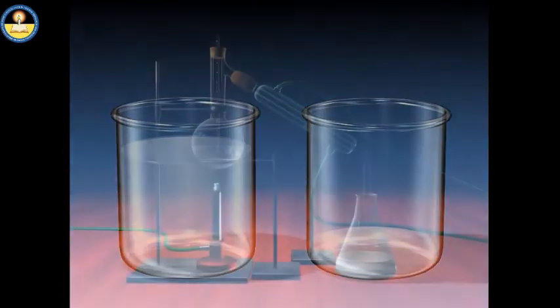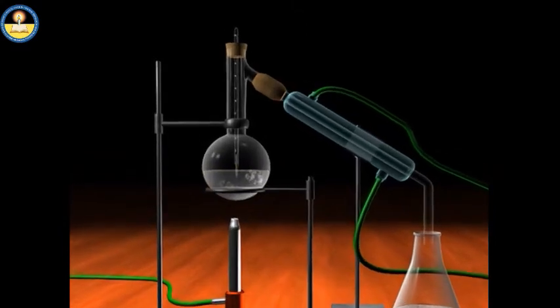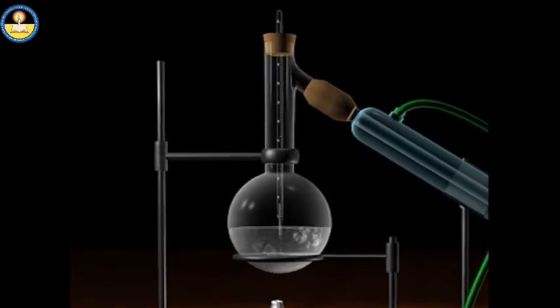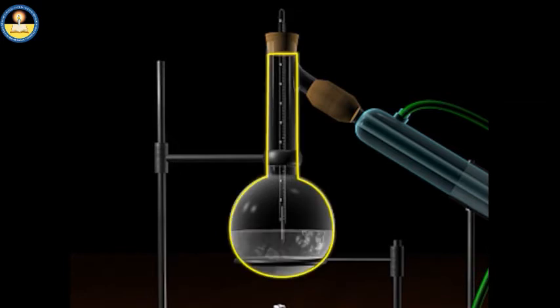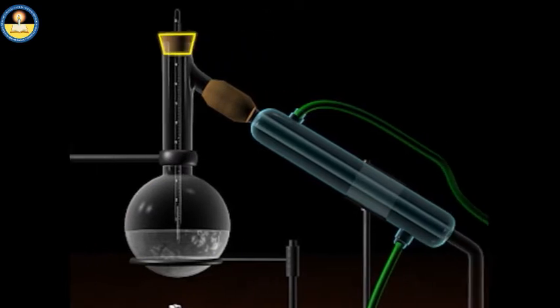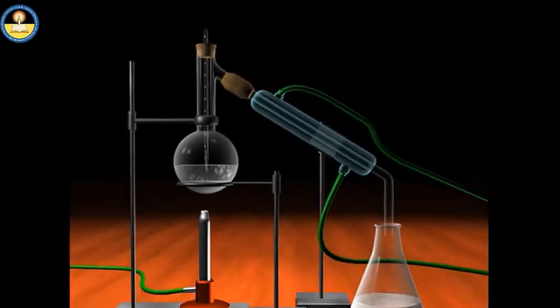Let us now perform an activity to show separation of acetone from water. Acetone and water form a homogeneous mixture, as they are miscible in each other in all proportions. We take 25 milliliters of acetone and water mixture in 1:1 ratio in a 100 ml round bottom flask. Fit the cork, thermometer and water condenser as shown in animation.